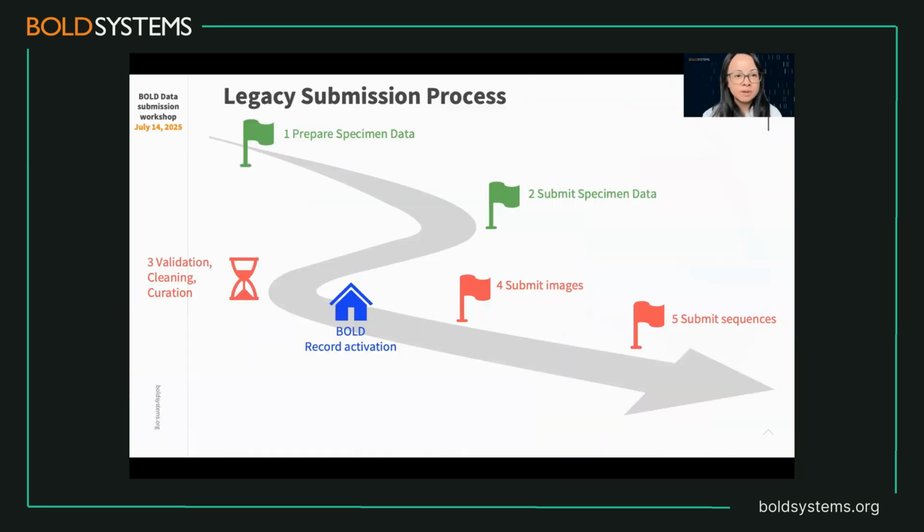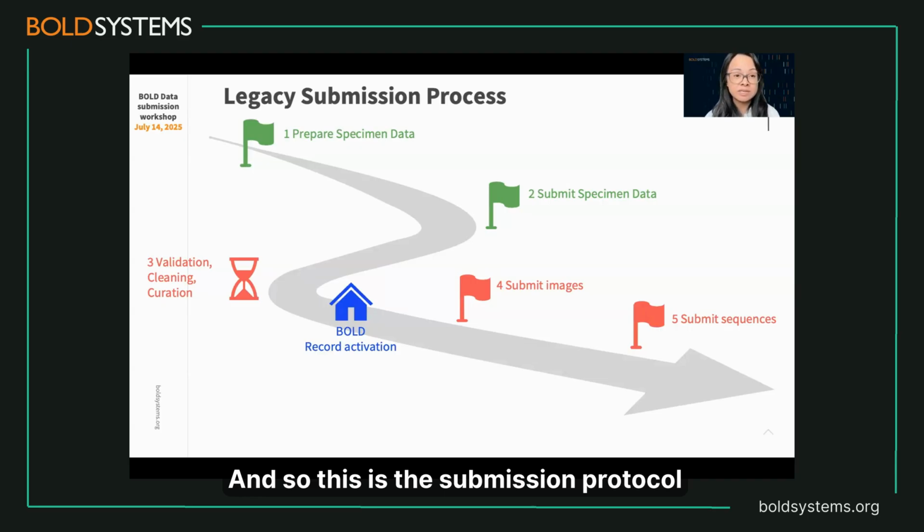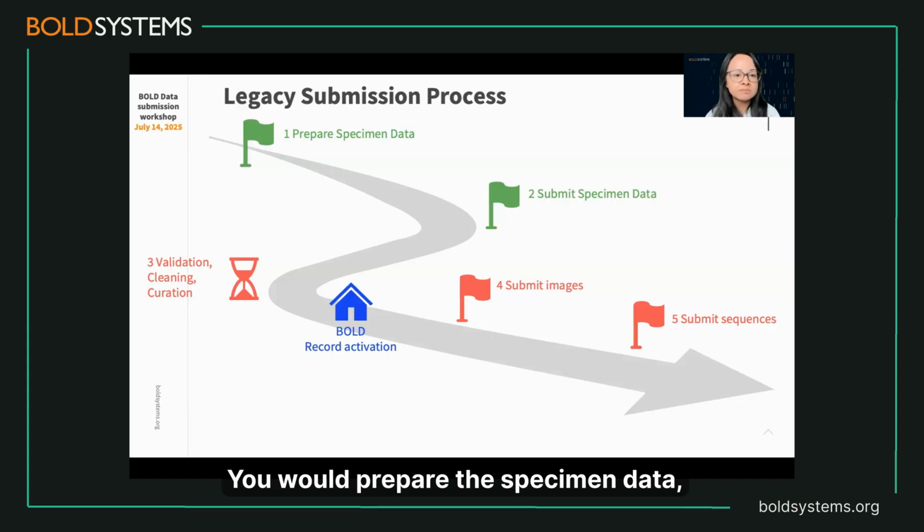Hello, everyone. Just as a segue into today's talk, I'd like to talk about the legacy submission process. This is the submission protocol that you may be more familiar with, BOLD 4. You would prepare the specimen data, enter it into a worksheet, and then submit that online. And then there would be a pause where there was validation and cleaning and curation going on.